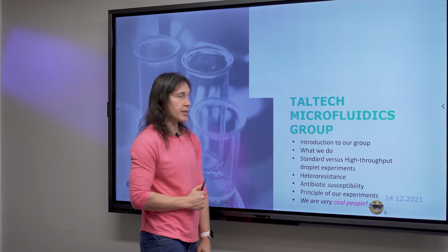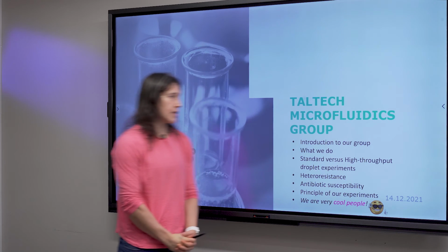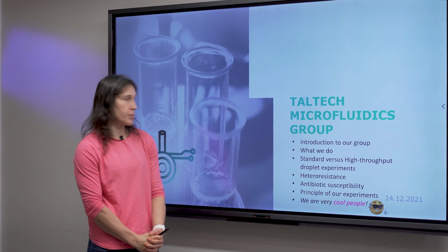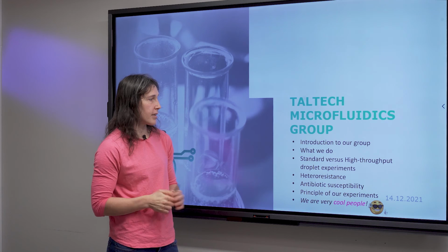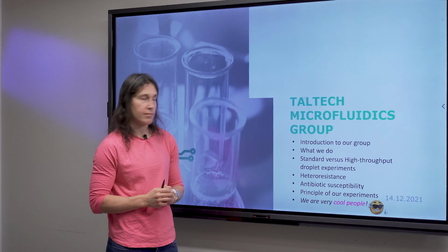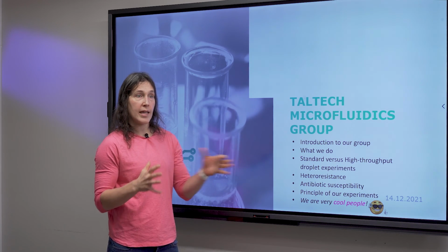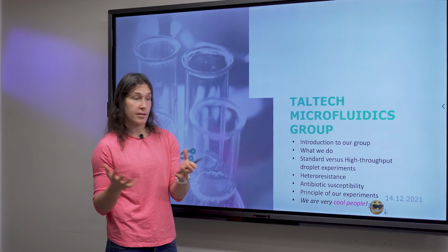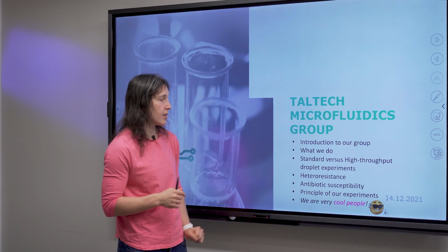So this brings me to the final conclusion. Our group is here at TalTech University, and I explained that we work mainly with antibiotic resistance and why we use droplet microfluidics for this versus the standard way to do it.